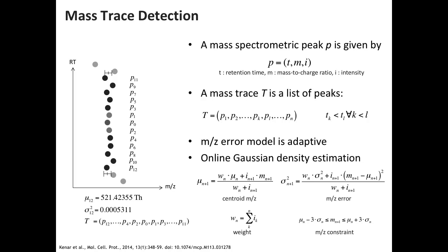It's a relative threshold. So this technique would be very sensitive to contamination or dirtiness of the mass spectrometer. If you have a lot of noise, then obviously the sensitivity of these peak measurements goes down. So you'd be artificially cutting off your sensitivity measurement. Well, you will see in a minute that it's way too sensitive still. So it works reasonably well, it just has some issues.